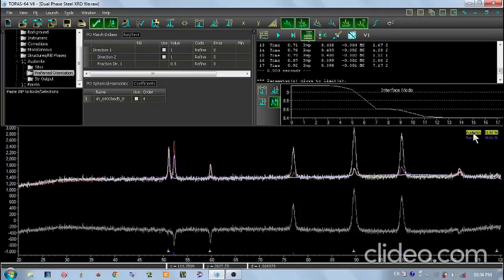These are the austenite phases present, which have not been fitted properly, and we will be fitting them now. This is one austenite peak, this is another austenite peak, this is another austenite peak, and these are the other FCC peaks, 1, 2, 3.